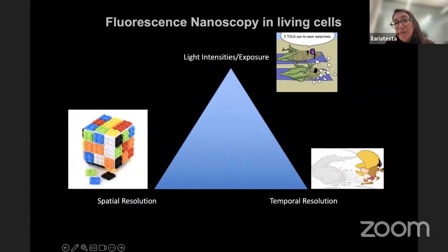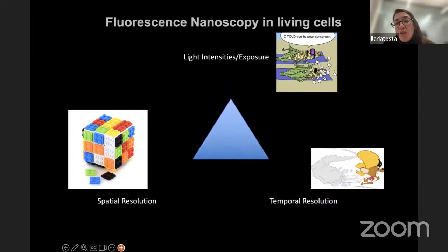And then there is the speed part, right? Most microscopists are familiar with the Shannon-Nyquist principle. So for example, if you want to have a confocal microscope, the scanning step of maybe 70, 100 nanometers is enough. But if you want to get a resolution of 50 nanometers, then you have to sample every 20, and then things get slower because you need more pixels, you need more light. So this is also a bit of a nightmare. So you have to think, and that's what we think a lot about, of ways to make the triangle smaller.